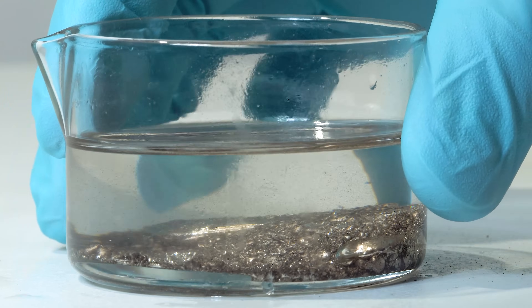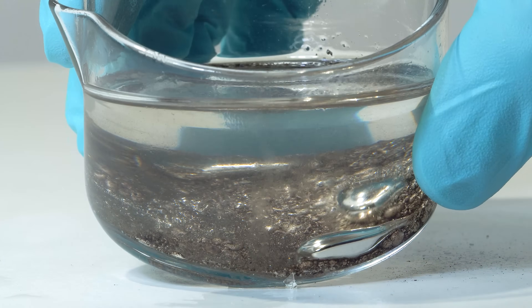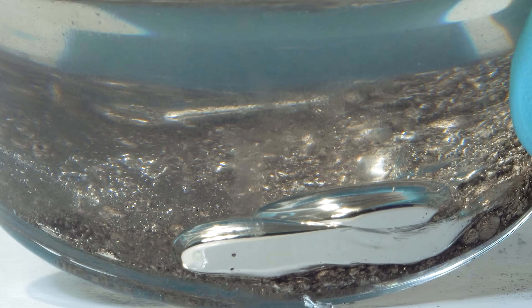Look – the resulting liquid has a shiny metallic color. This is our very active rubidium-cesium alloy.